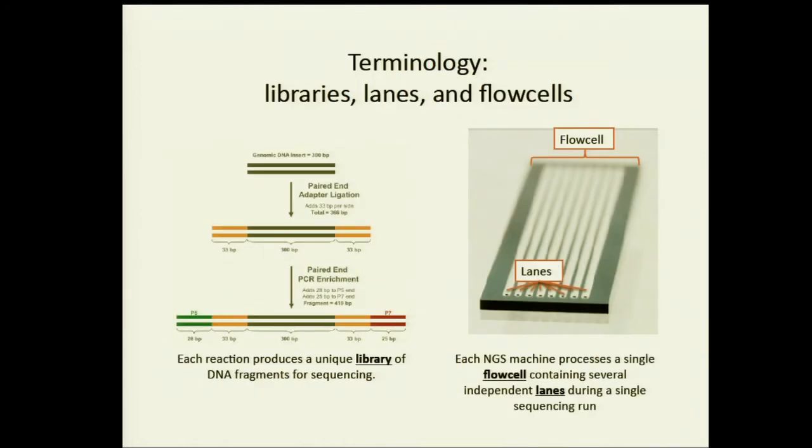So this is quick terminology. Those in the sequencing department here can probably explain this even better than I can. But I just want to give you the high-level terminology and concepts so you know what we're talking about later on. And this will be very important later on for one of Ryan's talks, where he talks about calibration of data. Remember we talked about those fragments a couple of slides ago? This is a little piece of DNA. What happens is these fragments are all part of a library. And these libraries, you'd have one library per sample.